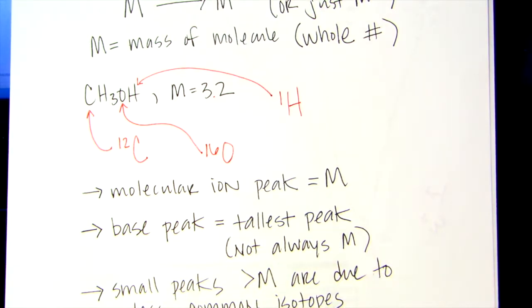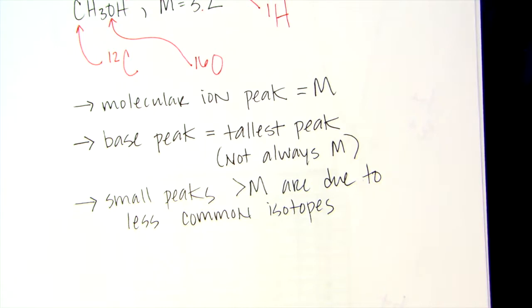And so we're going to talk about the isotope patterns because there are very distinct ratios of isotope patterns that will tell you what types of atoms you have in your molecule. So that's part of piecing together the molecular formula: you'll see these isotope patterns based on the natural abundance of the isotopes. And that tells you what atoms you might have in there. So like for carbon, for example, we're doing OChem, we're always going to see carbon. The other isotope of carbon is carbon-13. So you'll see a little peak at M+1 that represents the molecule that has carbon-13 in it. But it's a very small amount because it's a very small ratio.